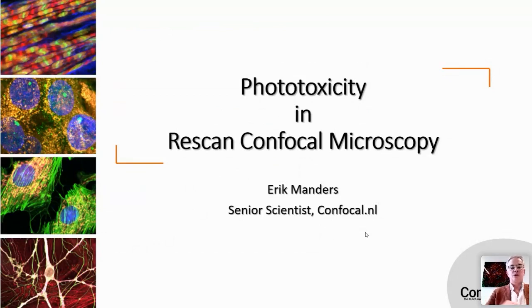So we will talk about the fundamentals of phototoxicity and then see how we can reduce it and how we can optimize the microscope to get good imaging.